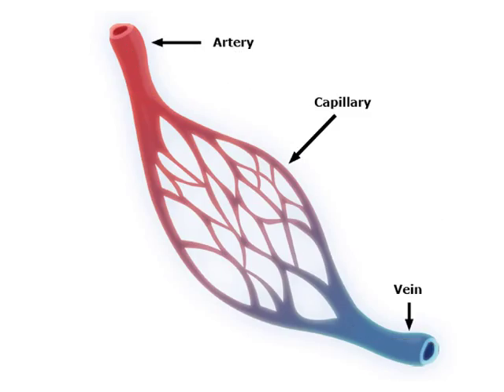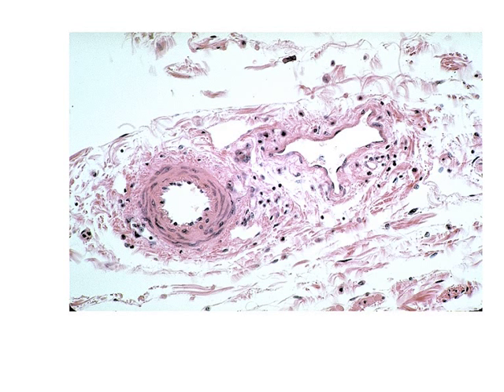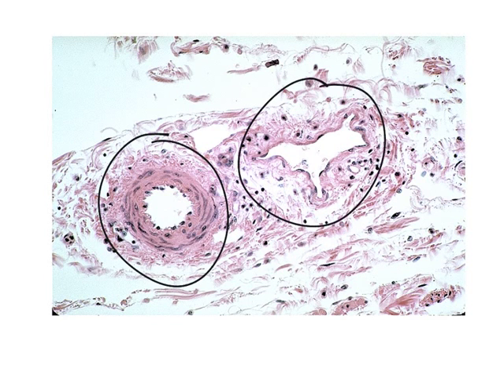And then, as I promised, this is a histology slide of an artery and a vein. This right here is the artery, and this is the vein. It doesn't really look like a vein, right? It looks kind of like a bat, the bat signal, or like a flying pig or an elephant. I don't know. I have a vivid imagination.